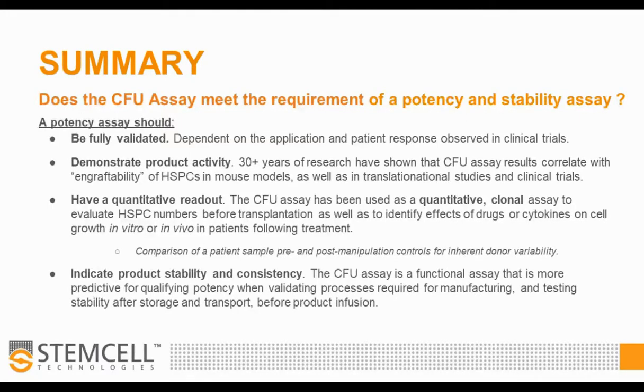So I'm going a little over time, so I'm just going to summarize now and go back to the question: what are the answers? Does the CFU assay meet the requirements of a potency and stability assay? I'm going to start from the bottom because I think that's a little easier here. When you look at one of the criteria for a potency assay, that it should indicate product stability and consistency, I think that's a resounding yes for the CFU assay.